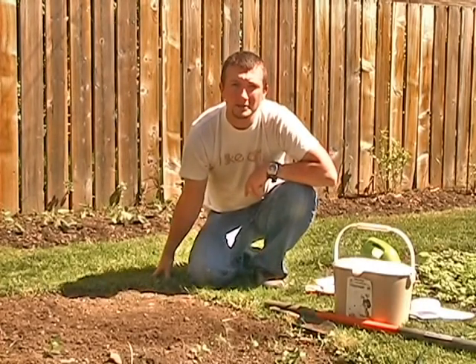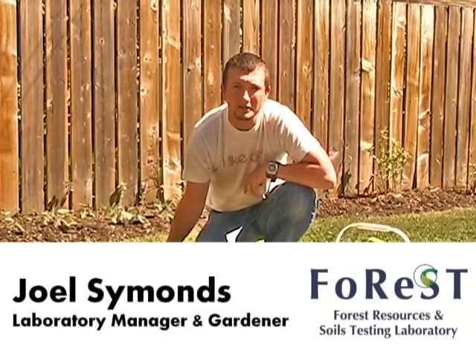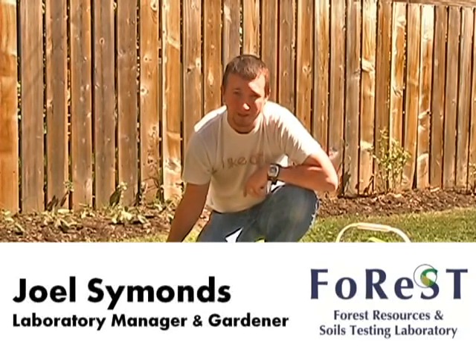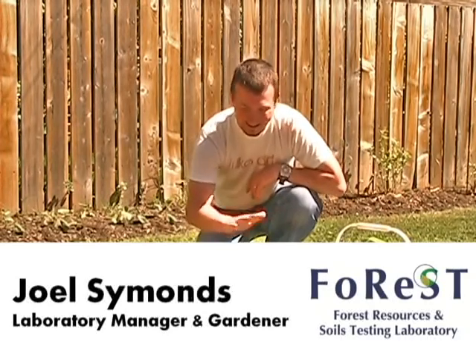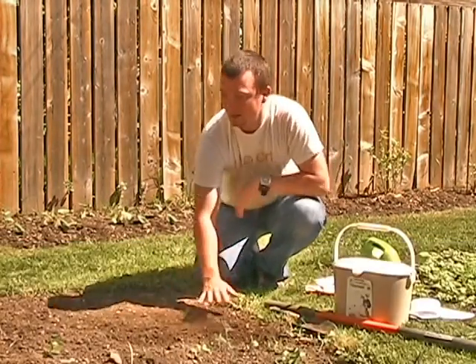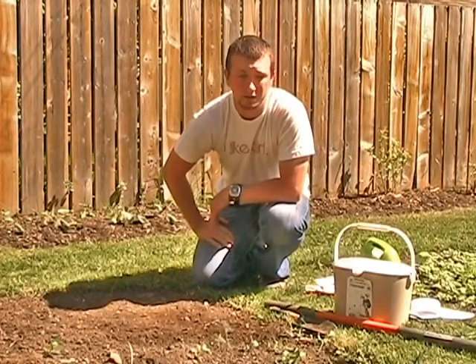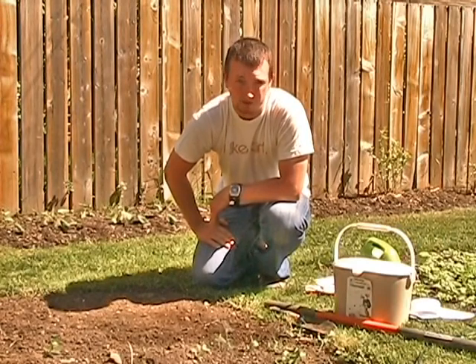Hello everybody. My name is Joel Simmons. I'm the manager at Lakehead University Forest Resources and Soil Testing Lab — that's Forest Lab for short. Today we're going to be showing you how to do a proper soil sampling, and that's a really important part of getting good accurate soil test results: taking a good soil sample.